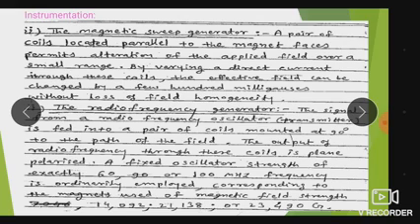or 23,490 gauss. So depending upon this, the signal from the radio frequency oscillator is fed into a pair of coils mounted at 90 degrees to the path of the field.